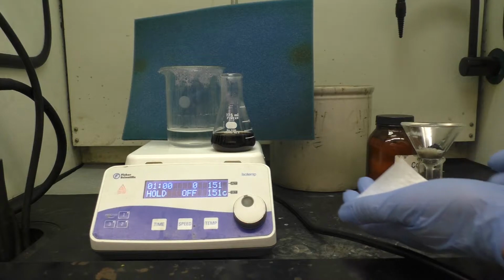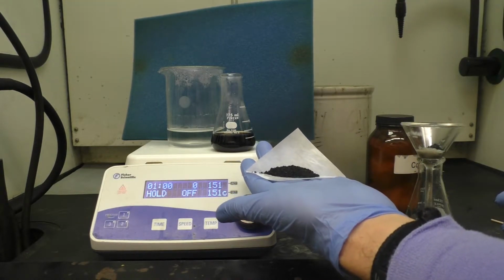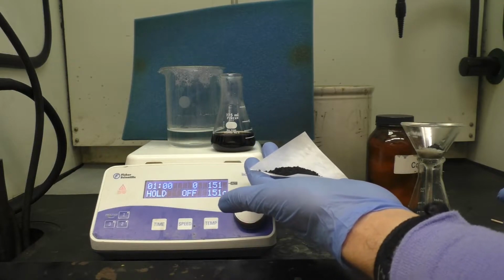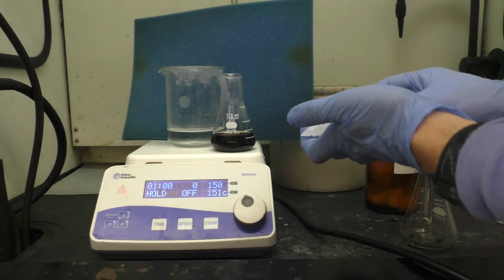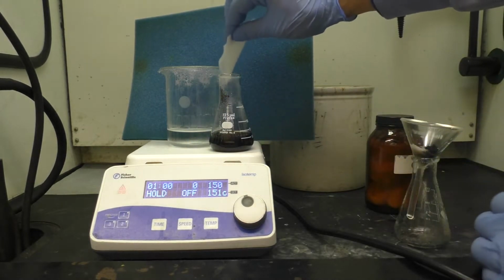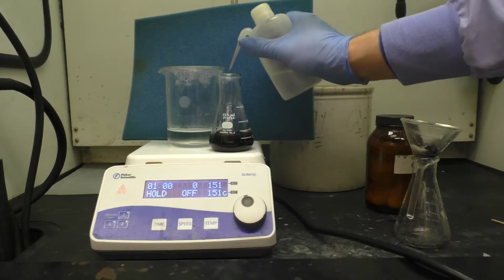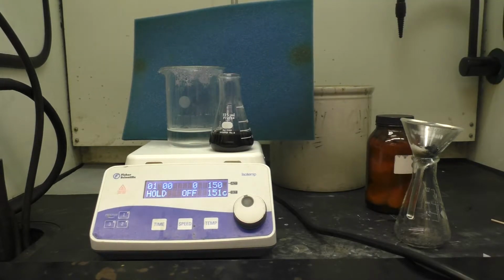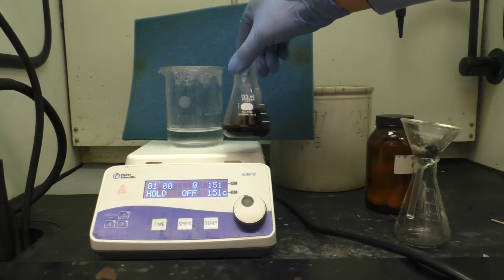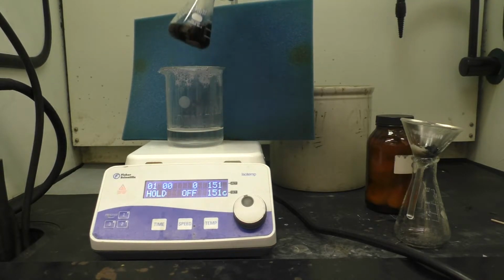So here you can see I've weighed out about a gram, and in fact it's actually 999 milligrams more of the activated charcoal. I'm going to add this in. Rinse down just a little bit that's on the sides there. Now we'll put this back in the hot water bath for about another 10 to 15 minutes. Just hope to see if we can decolorize that solution a little bit more.